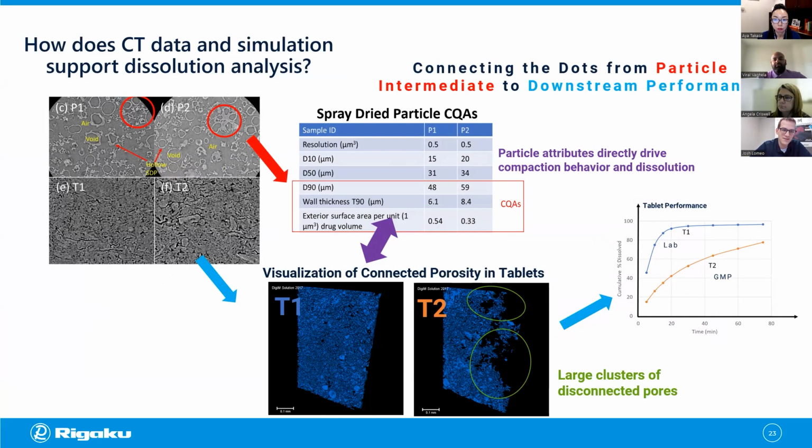It doesn't exclude the possibility of reaching this conclusion with them, but it would have taken quite a bit longer, say with something like mercury porosimetry or pycnometry, to understand that the porosity systems were this different in their actual structural interaction. I think that assessment would have taken quite a bit longer with more traditional lab techniques.